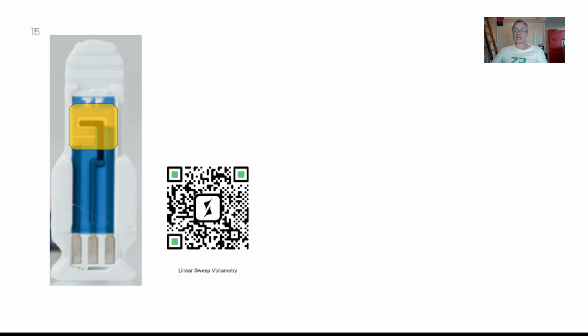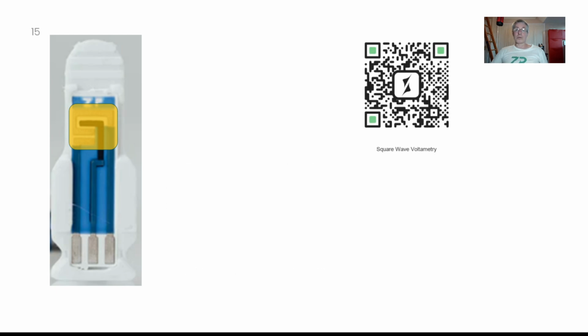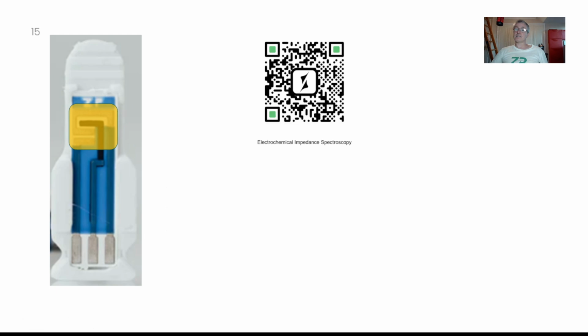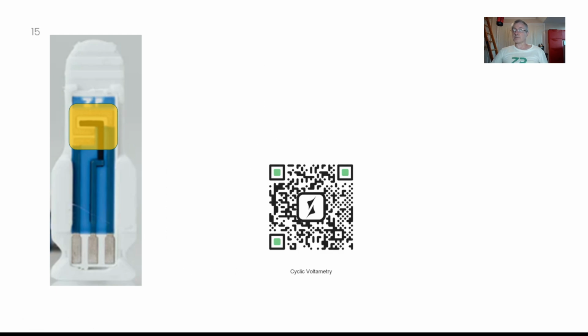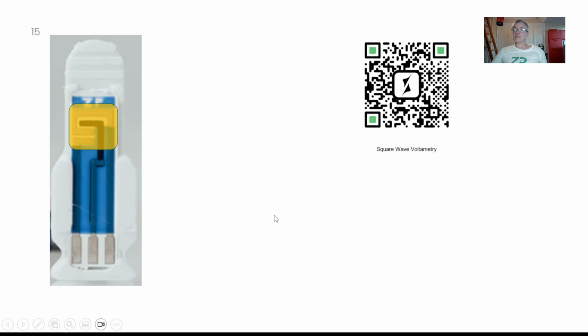I'm showing you the methods that are sensitive to resistance. Biofilms are generally resistive elements. They'll increase the resistance, and any of these techniques, cyclic voltammetry included, will be impacted by an increase in resistance. Maybe the best one for you is actually EIS. So I think you need hardware, you need sensors, and I suspect that the film will grow. It will end up blocking the electrodes, and you'll be able to pick that up, for example, through EIS, electrochemical impedance spectroscopy.